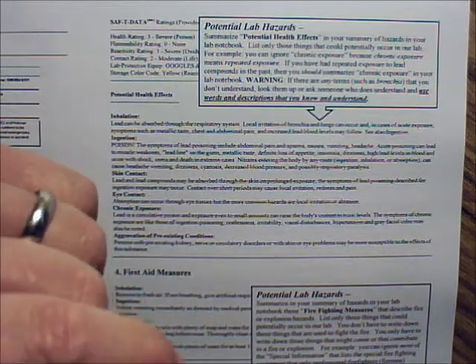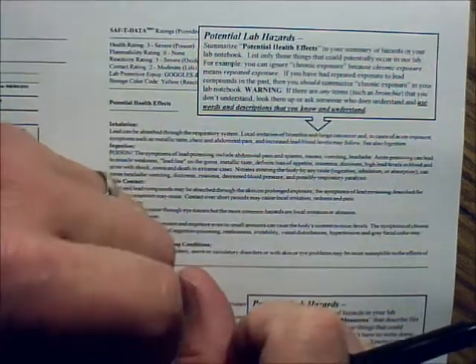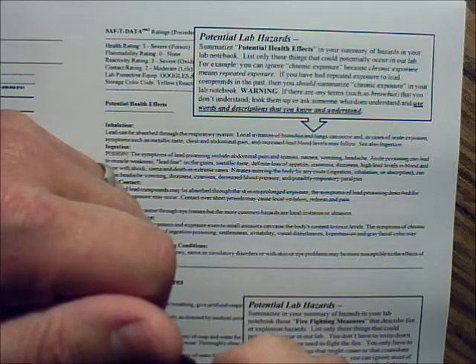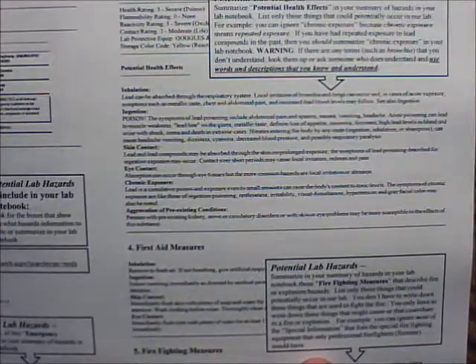If they're on fire, then you throw the fire blanket on them after you take off the plastic covering. What? Don't throw the fire blanket on them with the plastic still on it. Because the plastic might burn. Or melt. Melt, right. Okay. All right. Does everybody understand?